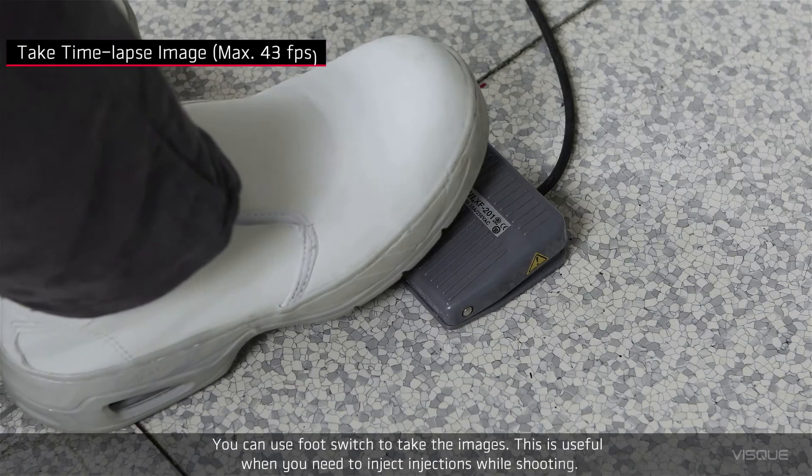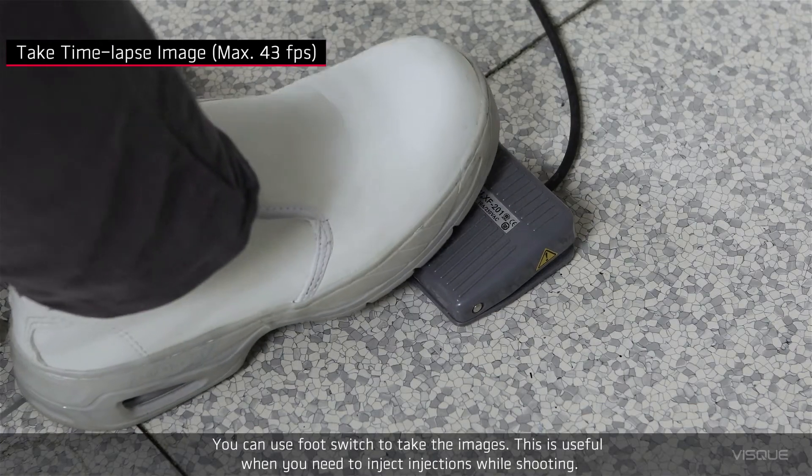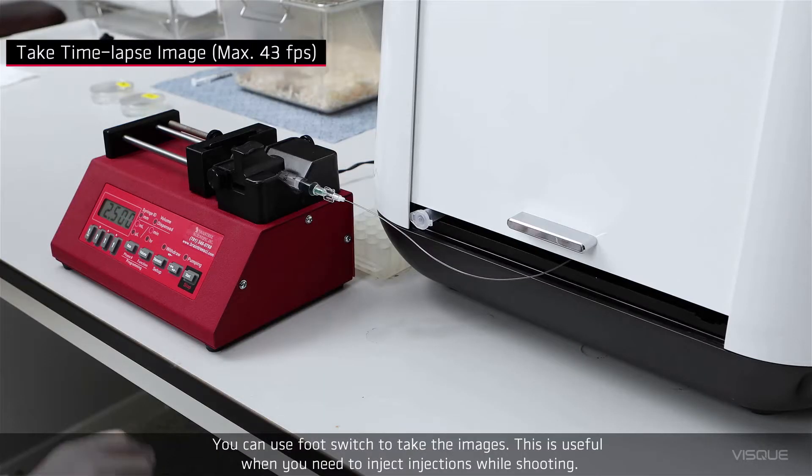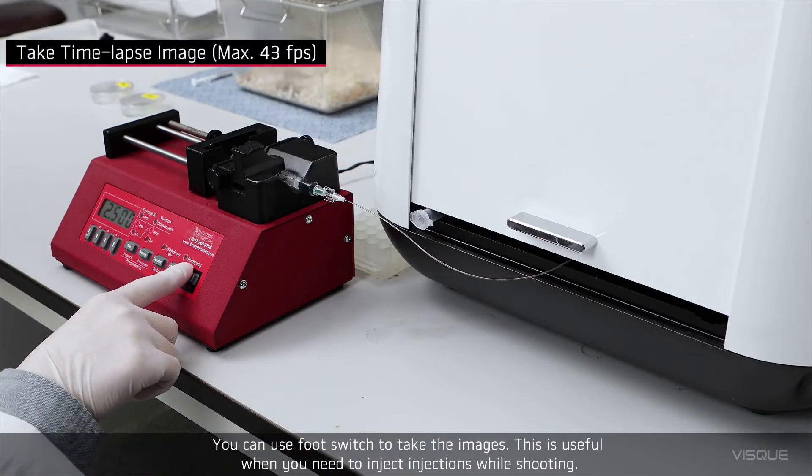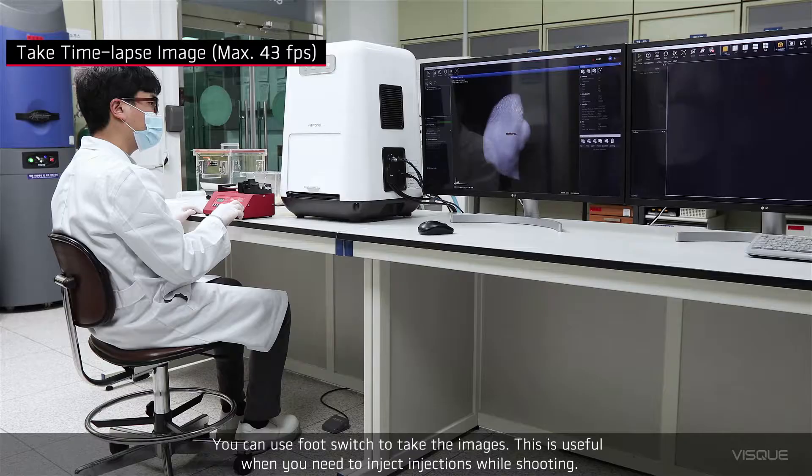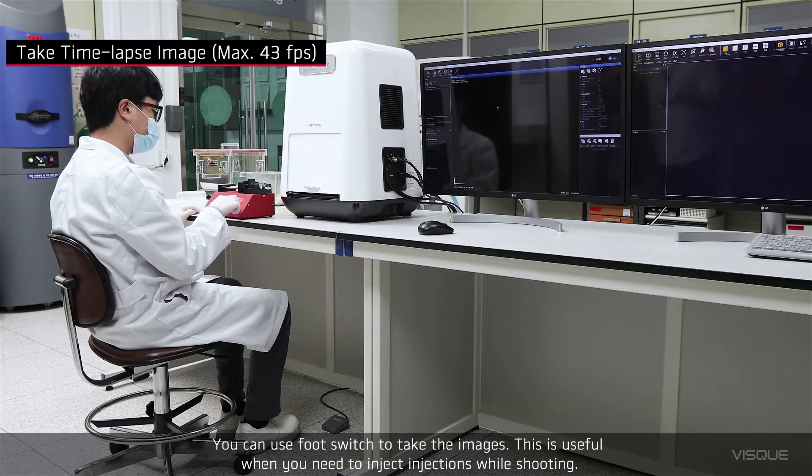You can use Footswitch to take the images. This is useful when you need to inject injections while shooting.